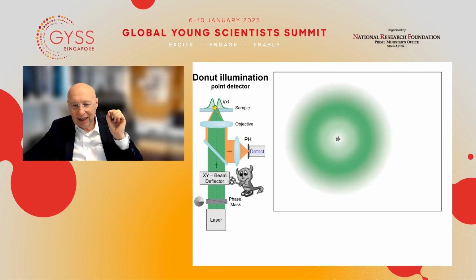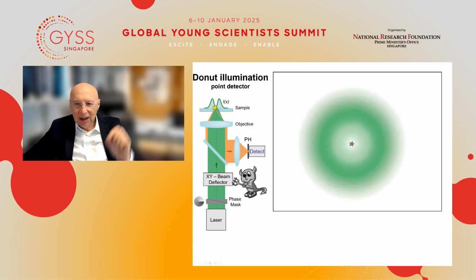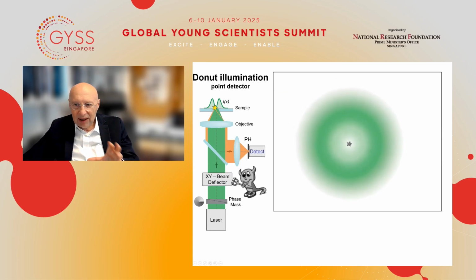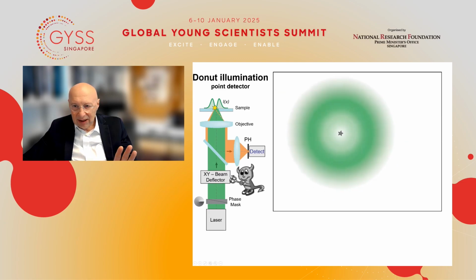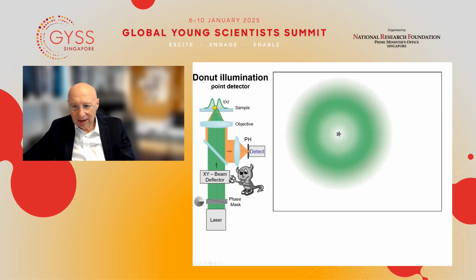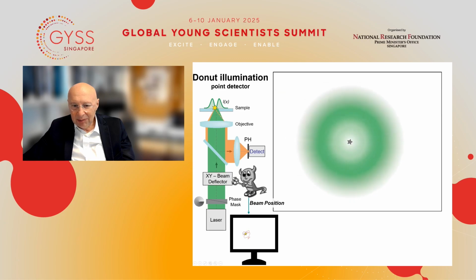So within an attosecond, if you like. Attoseconds have become very fashionable lately. So imagine that in no time, the demon puts the donut zero on top of the molecule. Now, if that is the case, then the molecule will never ever emit a fluorescent photon. So the detector will never make a click. Yet the molecule can be perfectly traced with arbitrary precision by the demon.